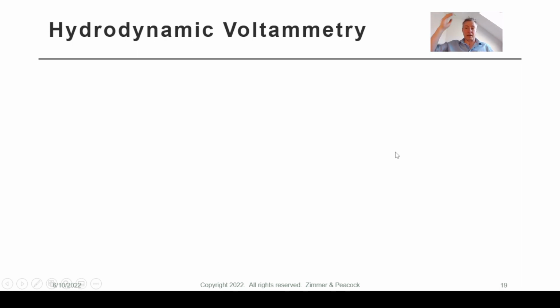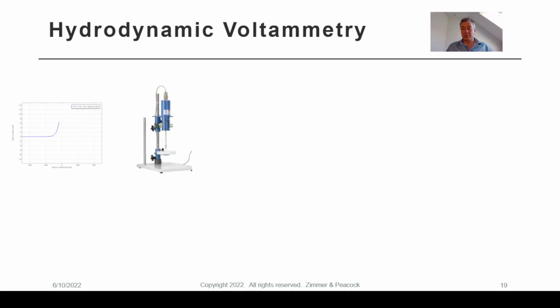I wanted to say, and I've said it several times, that electrochemists find this very fundamental, but the reason I don't find it quite so fundamental is if you did the same experiment in a different manner. When you look at an iconic cyclic voltammogram like this, it's done in an unstirred solution. But you could just as well do it on what's called a rotating disc electrode. If you're a biosensor developer, I don't recommend rotating disc electrodes necessarily, certainly not outside of an academic setting.